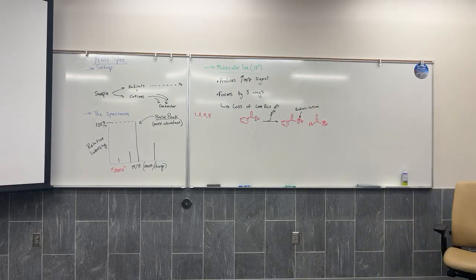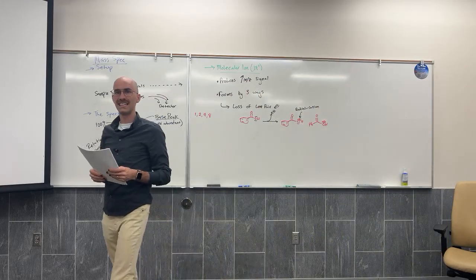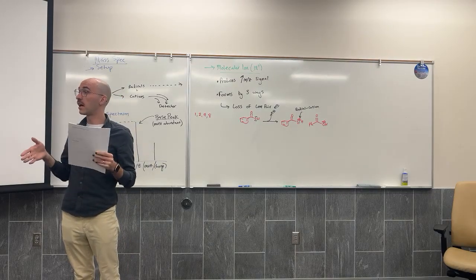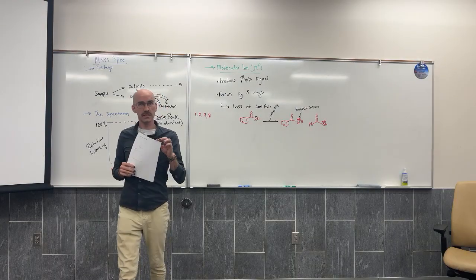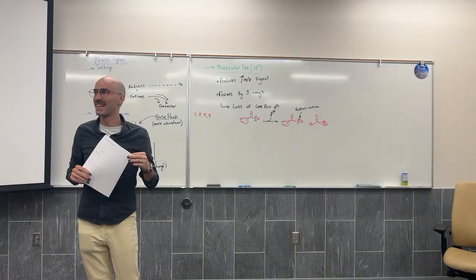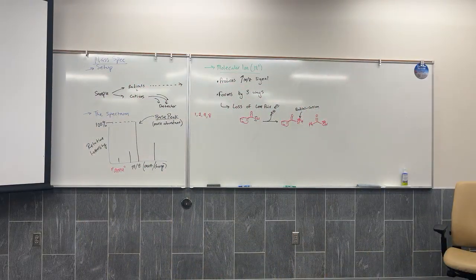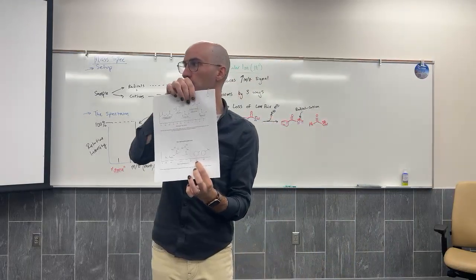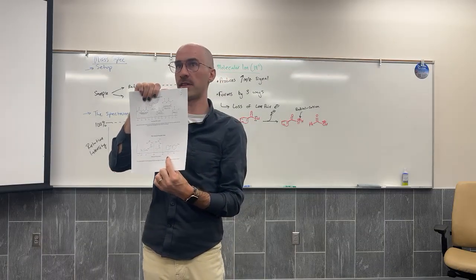And that mass per charge reading is, well, I've got this aromatic ring where I've got 6 carbons and 5 hydrogens. So 6 times 12, because the atomic mass of a carbon is 12. 6 times 12 is 72. And 5 is 77. If you look at your correlation table for mass spec, you'll actually see that if you have just an aromatic ring fragment, it shows up with a mass of 77.